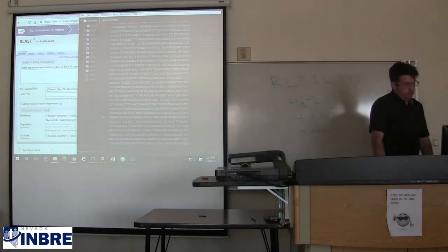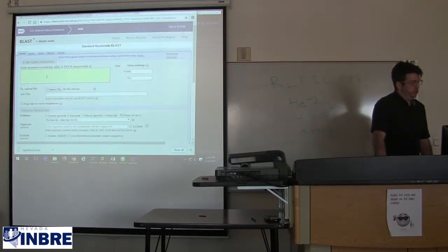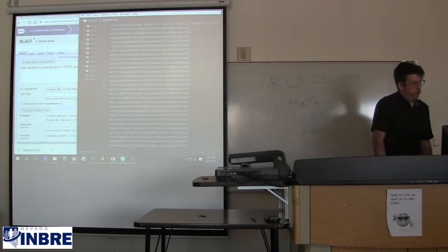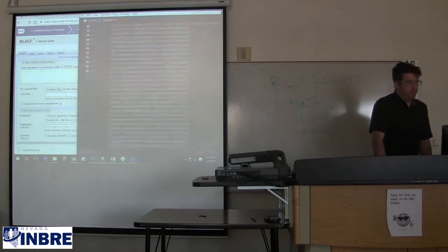And in terms of interfacing with what we get on this query creation page, we can either paste in the sequence that's in our Atom window, or we can just upload the file that contains it. And it's really up to you. What do you guys vote? Do we want to paste or do we want to upload? Paste. All right, let's paste.